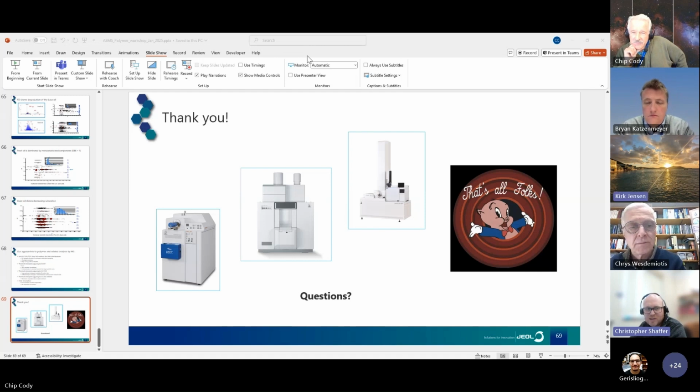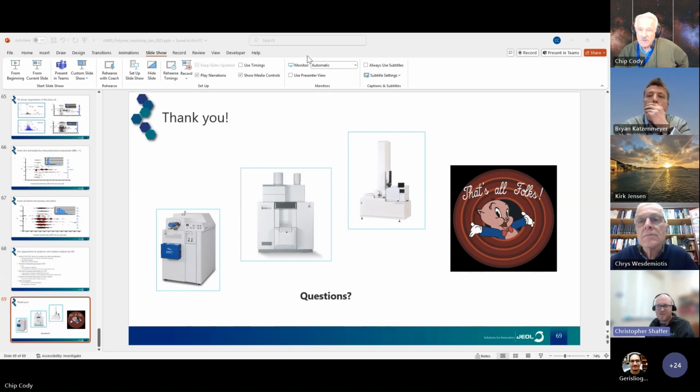And when you compare that against the data from the polypropylene study, I was going to ask, is there any suggestions you have for a semi-quantitative approach to understand the degree of oxidation? But your DBE part of that presentation does offer at least some potential insights on how to make that quantitatively insightful as well.